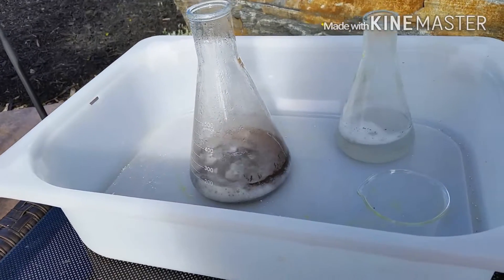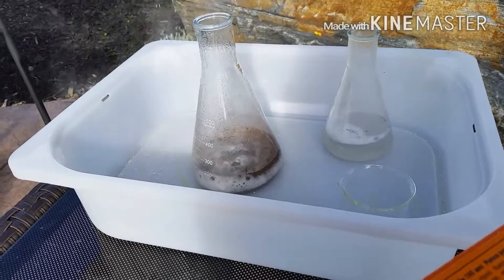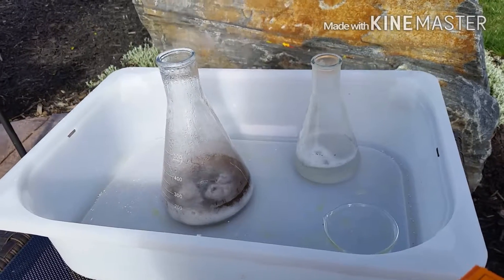We used the same amount of hydrochloric acid in each. This one's just a little bit more spread out than this one, so that might be the difference.